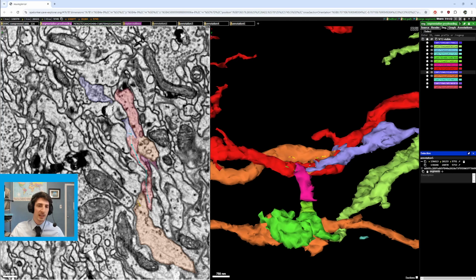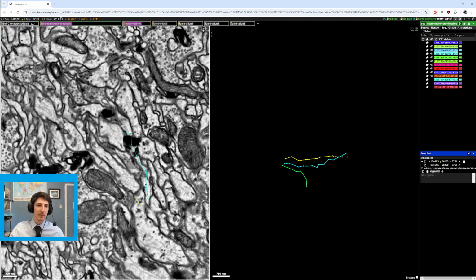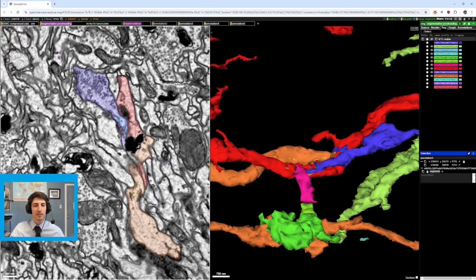And as you can see, it's intact over here, so we know this is good. So even though this swirl kind of breaks these pieces and causes a merger, we know that this is the correct path for this red piece to this purple piece. So what you would probably do mid-path making is split as you go, so that you have more colors instead of one solid color that is connected to multiple paths. So there's that path solved.